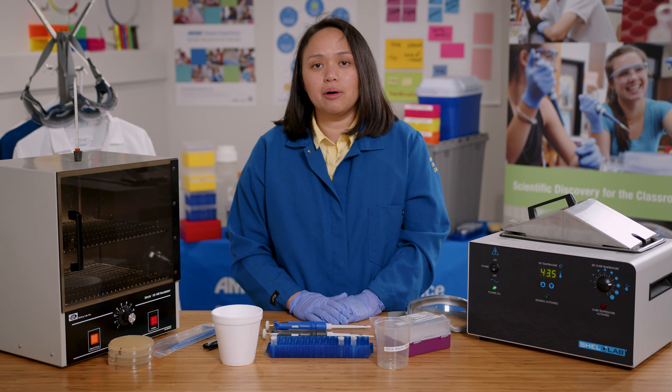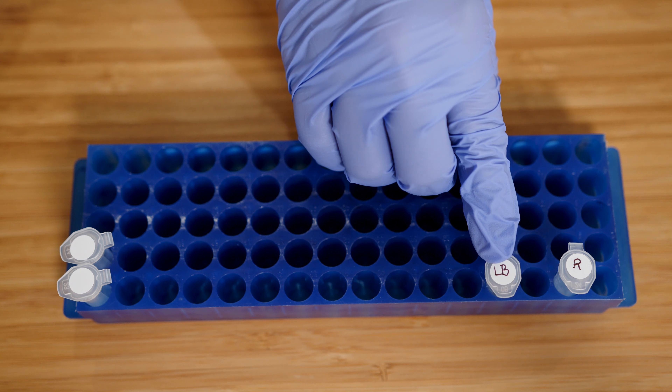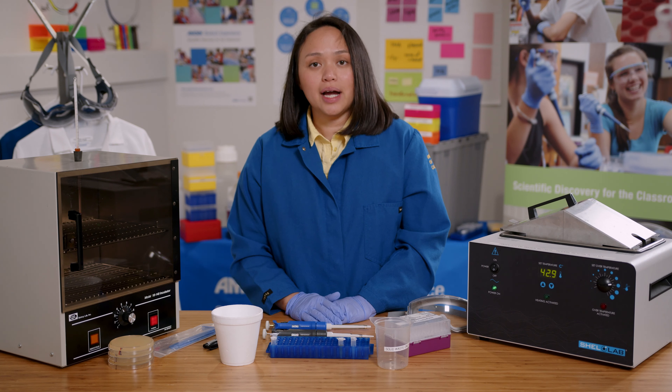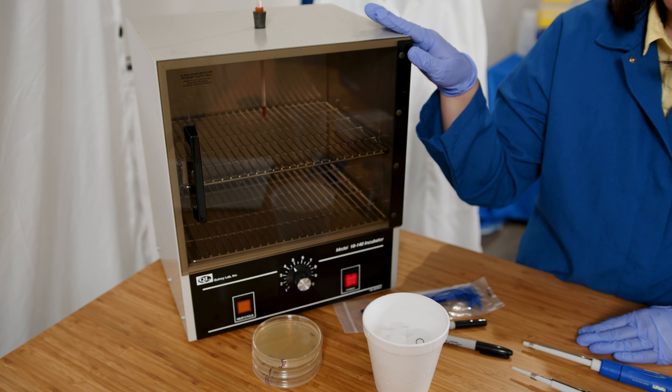After the heat shock, I will put everything back on ice. I'll then add LB, or Luria broth, which provides the cells with nutrients and allows them to grow. Finally, I'll plate the cells on LB plates to grow overnight in the incubator.